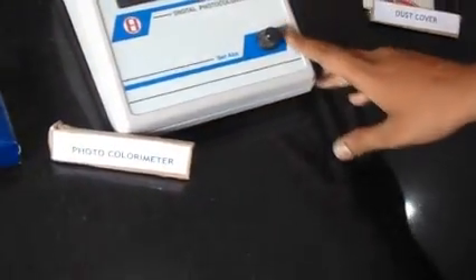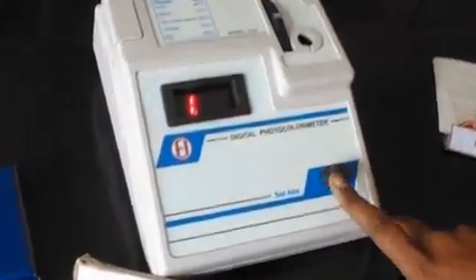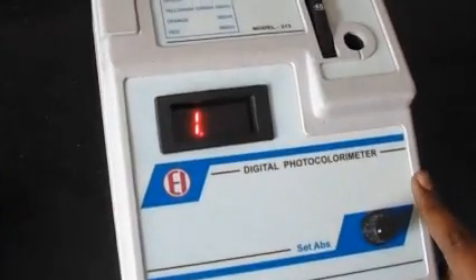Here we have the manual. You can go through the manual before operating this instrument. We have some known samples: this is a blue solution of copper sulphate (CuSO4), and this is a red solution of cobalt chloride (CoCl2).